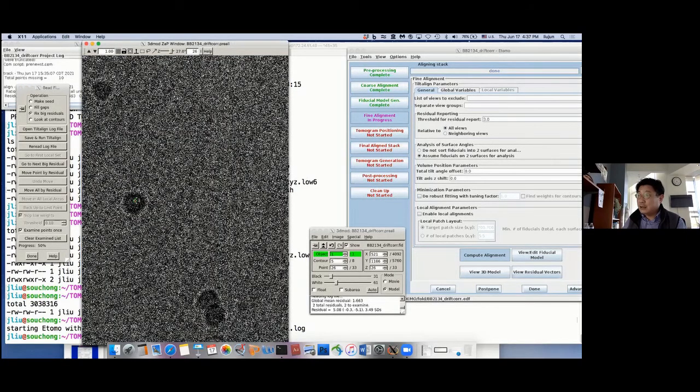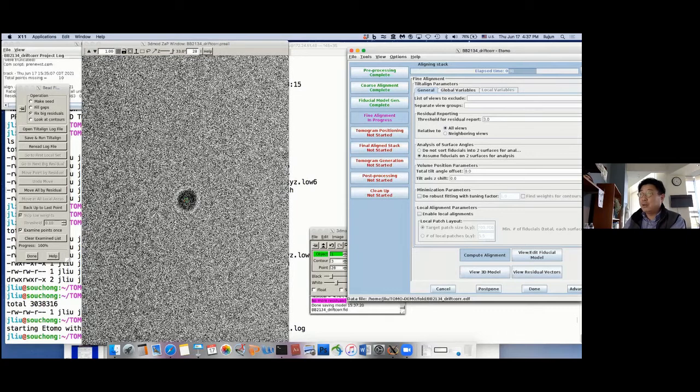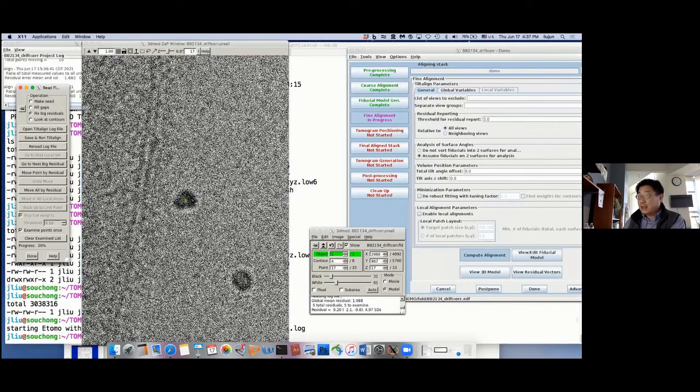You can see that the bead is not precisely in the middle of the gold, so you want to move it to the middle. And this is the same, not in the middle, so you can change it. This cannot be replaced by the computer because you have to make very intelligent decisions. And in this case, it's perfect.